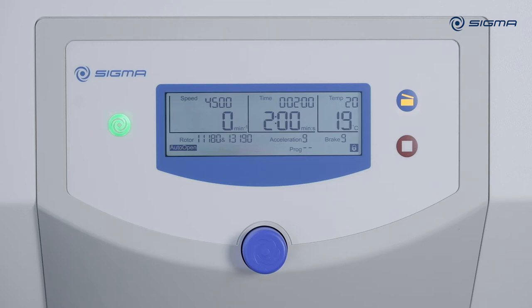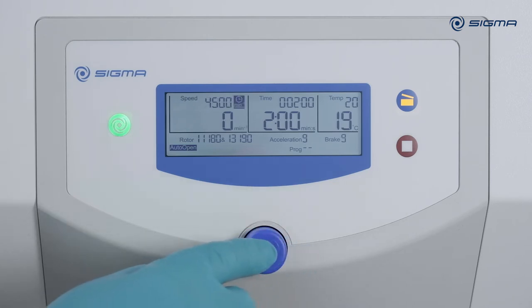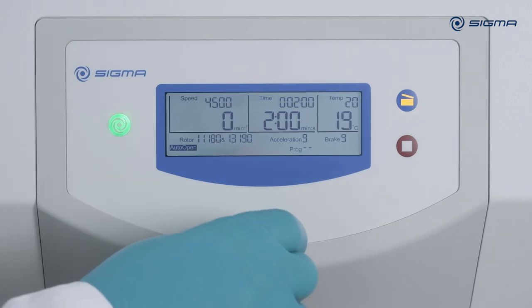You can optionally have the runtime start only after the centrifuge has reached the setpoint speed. To do so, turn the knob three clicks to the right, then activate the option by pressing the knob and turning it one click to the right. Then press the knob again to confirm the setting.